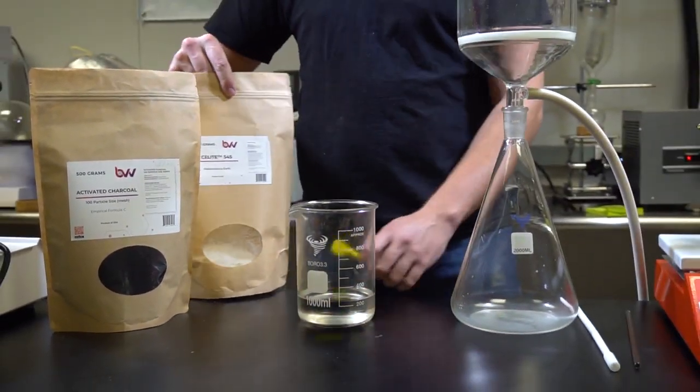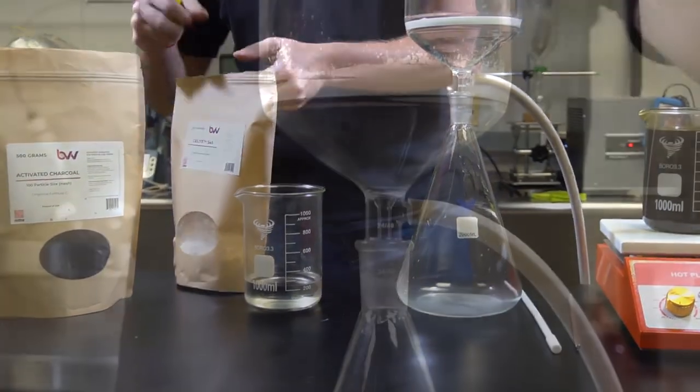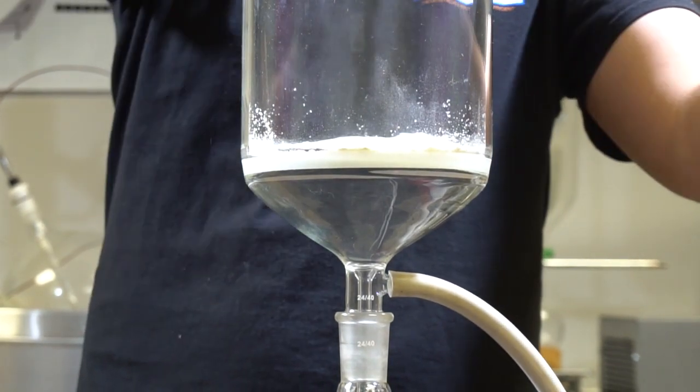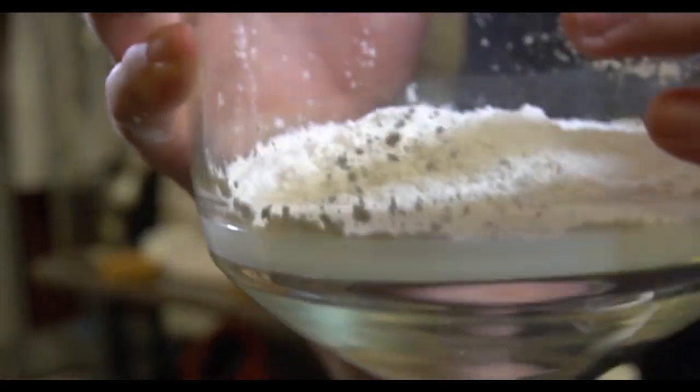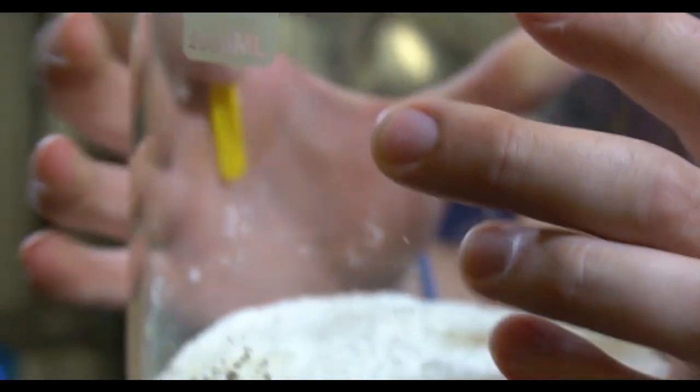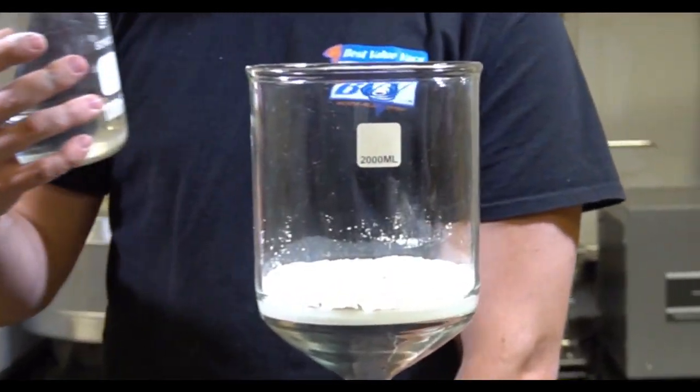So we're going to start off by just making a nice quarter inch patty of Sealight 545. Now we're going to turn on my vacuum pump and I'm going to use ethanol to flatten out my mixture in here.